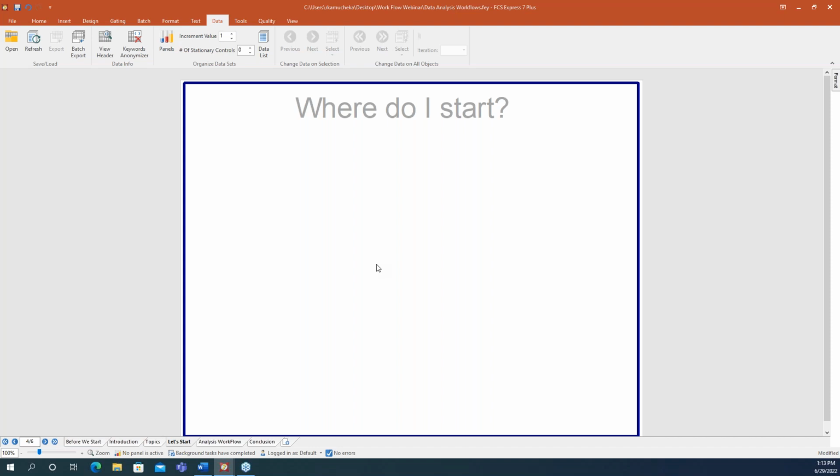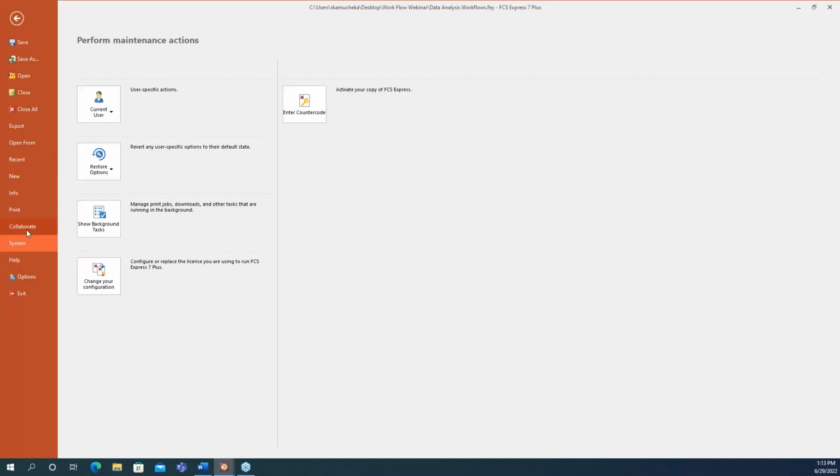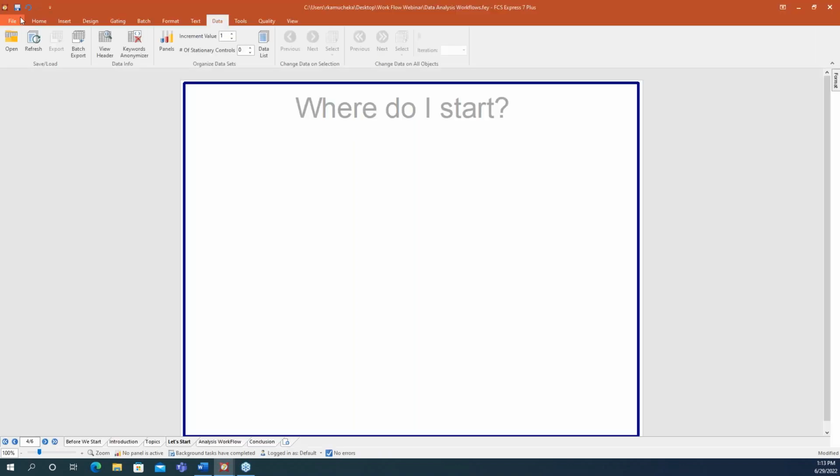You can also individualize it if that's the better way to go, right? So again, just introducing that flexibility to make sure that you can do what you need to do. Now, if you're interested in sharing that user file, we go to System, Current User, and you can export or import these options from a file again to either share them with somebody else, standardize across the user group, give you some options there. So now we're back into our workspace and let's just start getting ready to analyze.